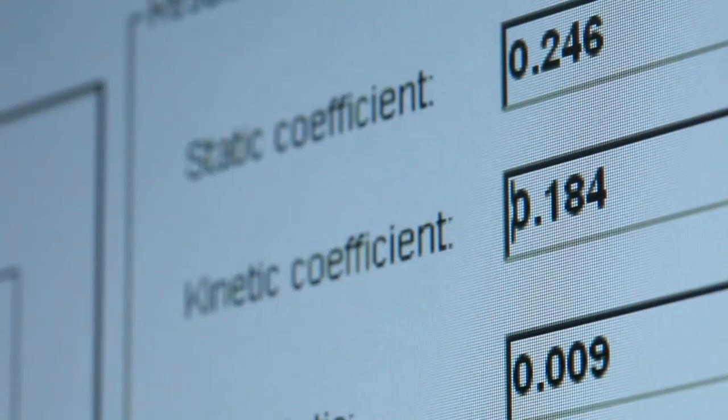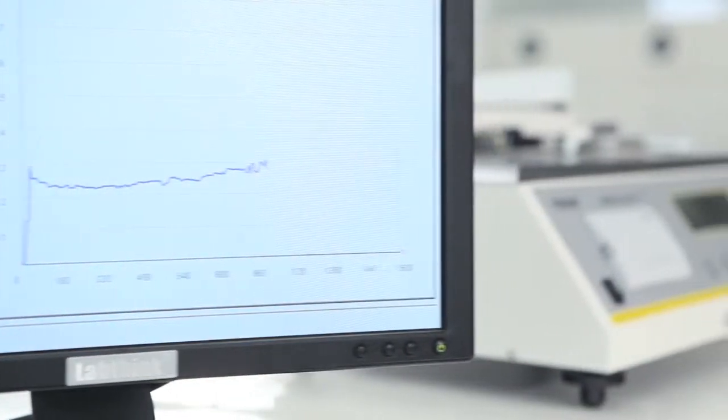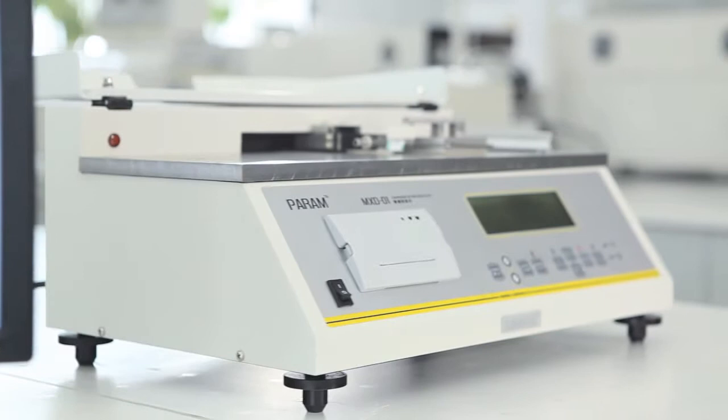The powerful data analytical function can help users determine the degree of confidence of the test results and the slip-stick behavior of the specimen.